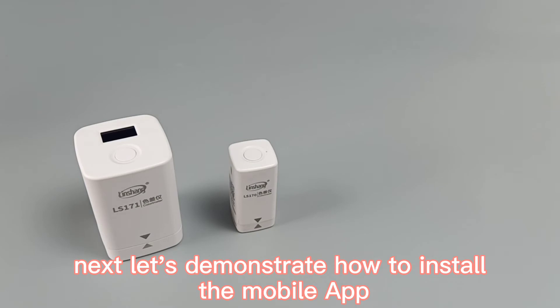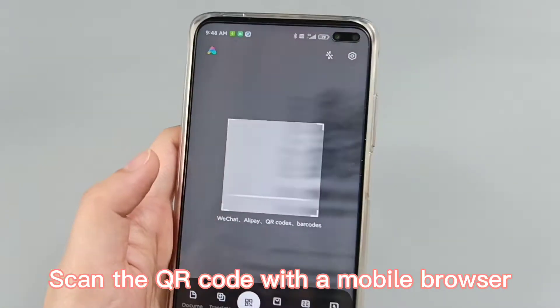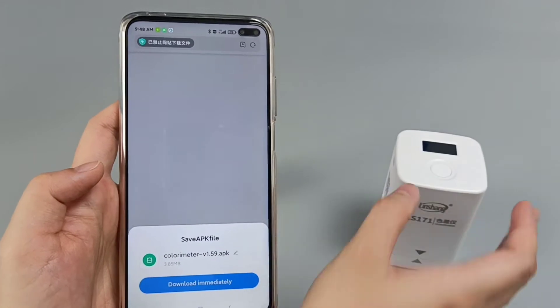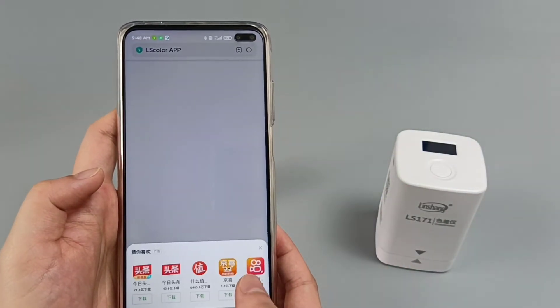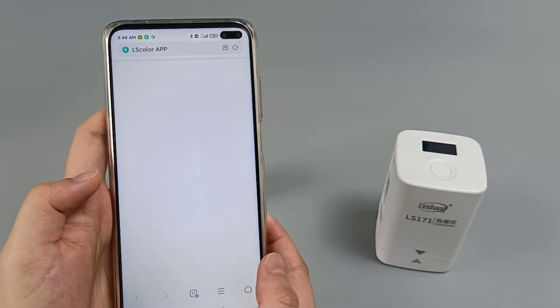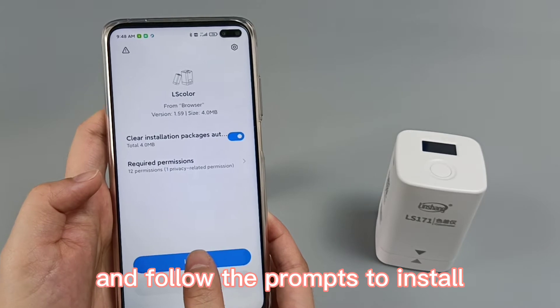Let's demonstrate how to install the mobile app. Scan the QR code with a mobile browser and follow the prompts to install.